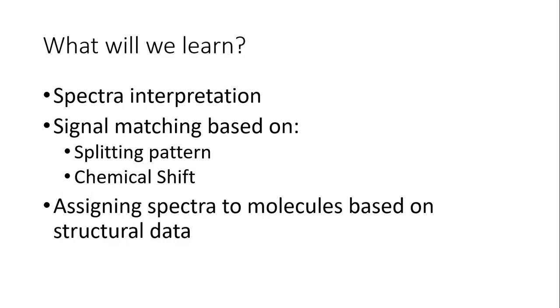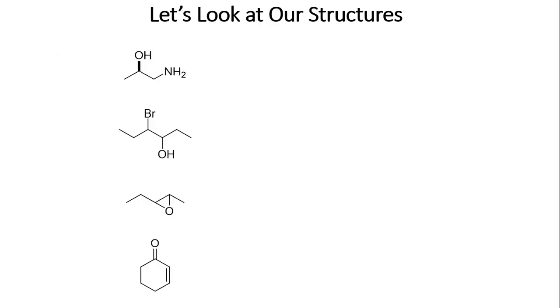All right. So what we're going to learn is how to interpret spectra, how to match signals based on the splitting pattern and the chemical shift. And then also we're going to assign spectra to certain molecules based on the structural data. So here we have 4 molecules.